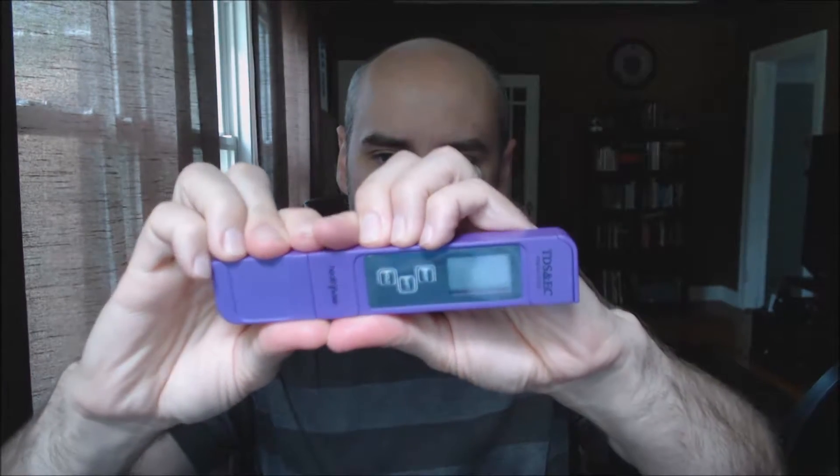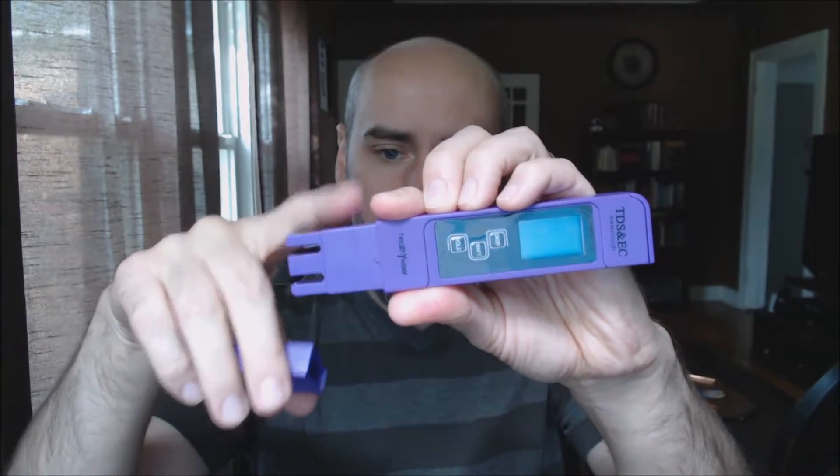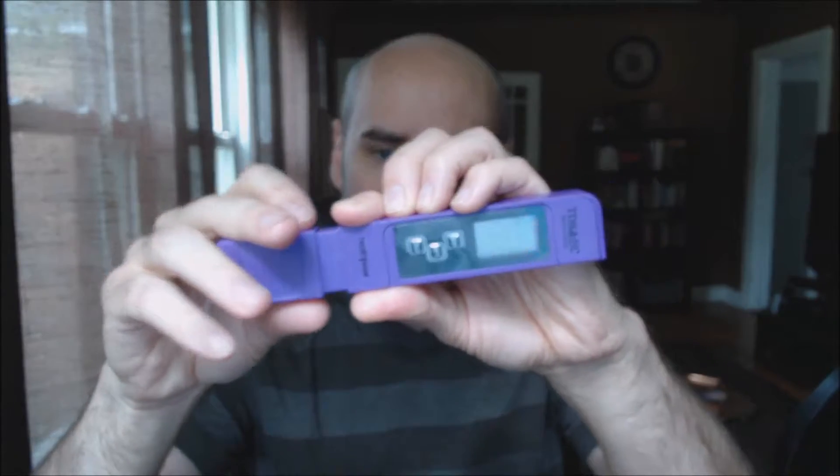This comes in its own little faux leather case. Inside you have the meter and it's got three buttons — on and off, and you can press and hold the shift button to switch over to the electrical conductivity test. You just take the end cap off and put this in whatever water or other liquids you want to test. It's really easy to use; you just want to make sure you wipe it off and clean it each time. We're going to do some tests and see how this works and what kind of levels we get.